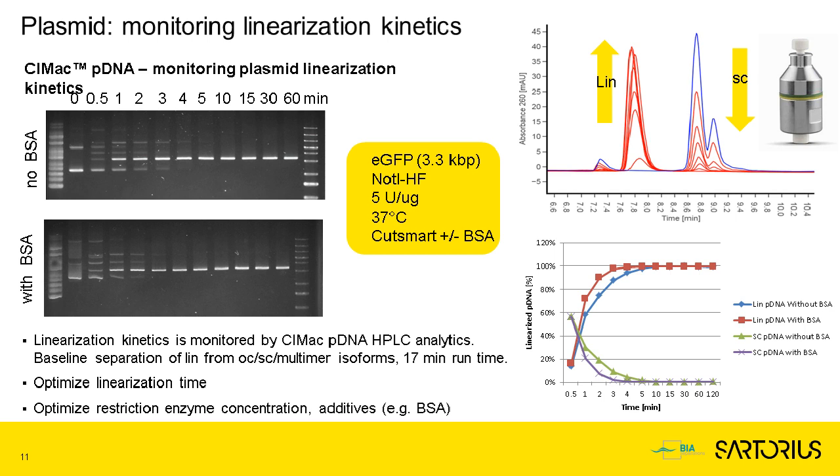Does BSA really have a significantly positive effect on linearization? And this is in fact the question that we asked in this particular experiment, and the answer was there was a mildly positive impact of BSA, but the linearization was completed in just 2 or 3 additional minutes in absence of BSA, so it was completely safe to drop BSA in this process, and this was information that was quantitative and could be easily interpreted.